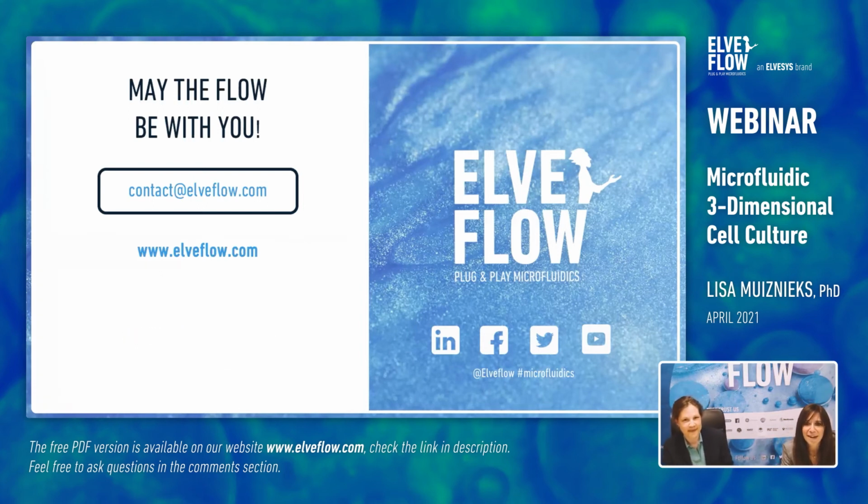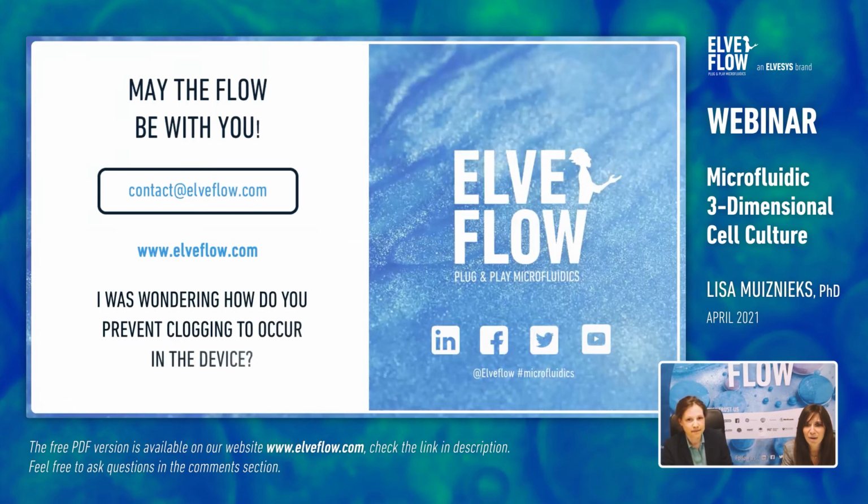So Amira, hello, thanks for this great presentation. I was wondering, how do you prevent clogging from occurring in the device? So the whole idea here is that the gel itself is entered into the chip through dedicated ports.